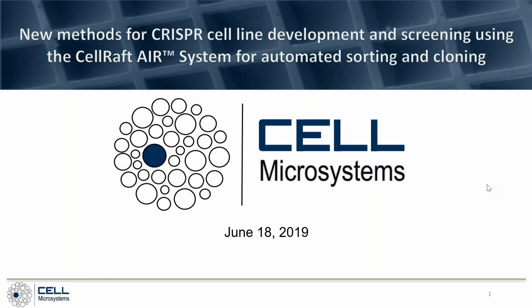And without further ado, I'll hand it off to Jacquelyn to get started. Okay, great. Thanks, James. So I'd like to start by briefly introducing the CellRaft technology and a few different protocols we've been developing in-house to streamline and automate CRISPR workflows for cell line development and single-cell cloning applications. I'll then pass the presentation over to Dr. Buchser to discuss the exciting work his lab is doing with CRISPR screening and phenotype unmixing.